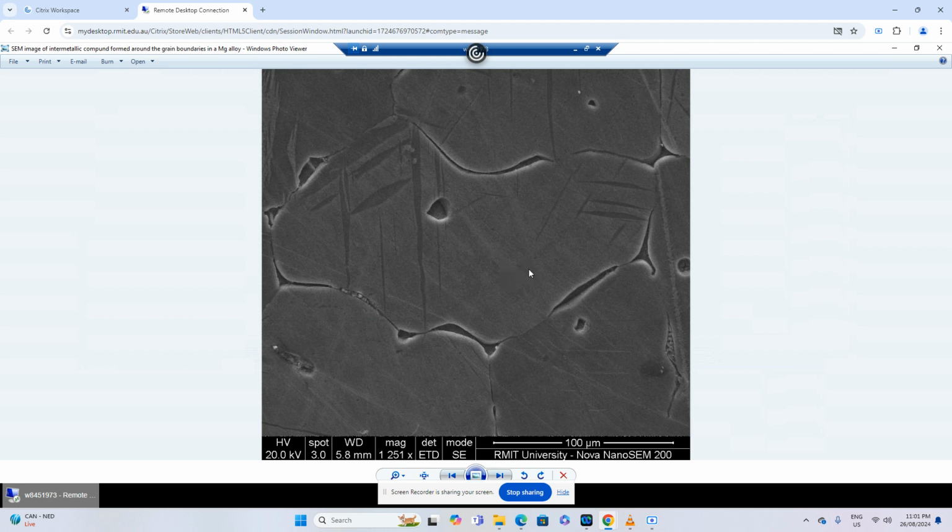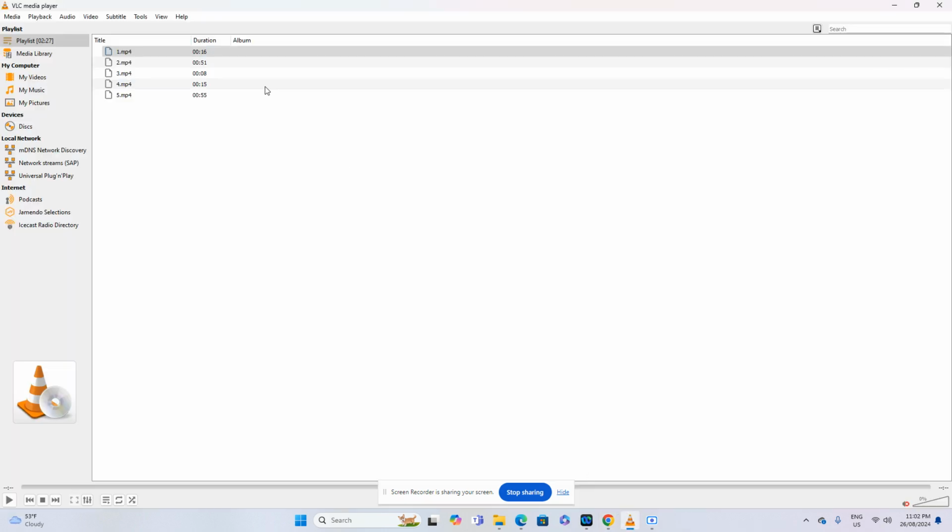Now I will show you some videos which I have recorded on an XRD machine at RMIT University, showing how we can prepare the sample and how we can mount the sample for XRD analysis, and then I will move on to analysis of the XRD data that we actually obtain after this experiment.